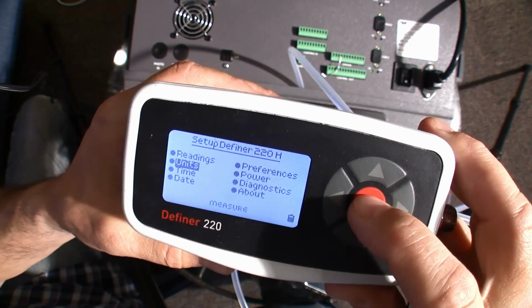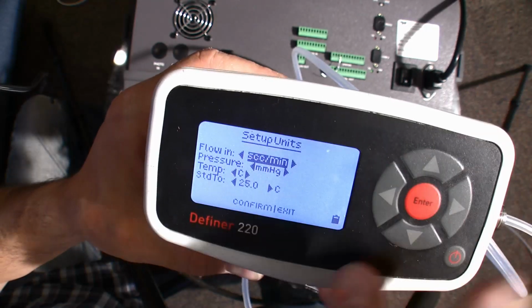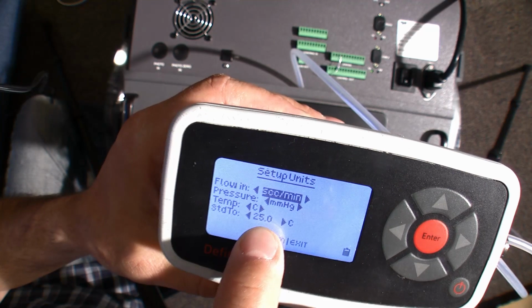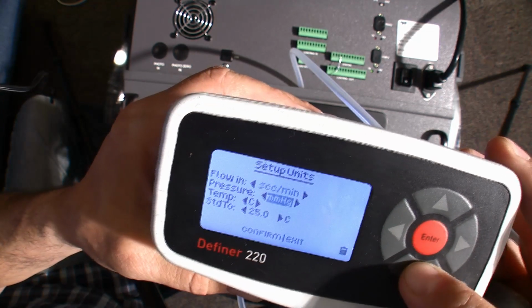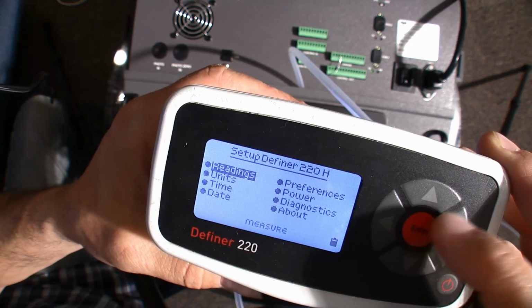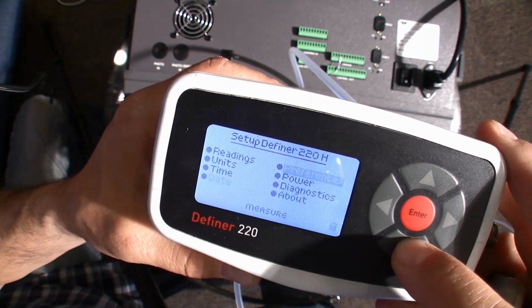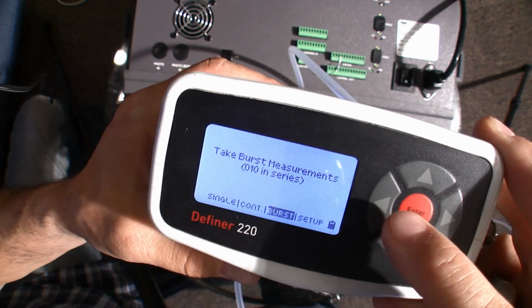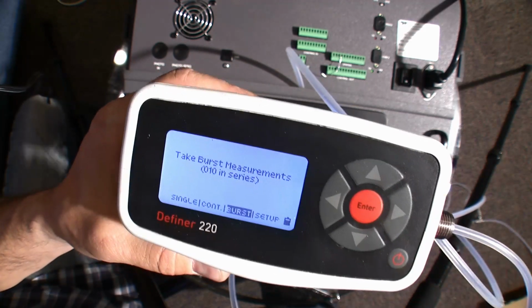And then we want to check our units. When these come back from Mesa Labs, they're almost always going to have this standard temperature set to 21.1. Now in the monitoring world we use 25°C, so make sure that you've saved that, adjusted it, and then confirm if you make a change, and then we'll go back to the main screen. Now I'm going to run this remotely. If you're running it manually, when you get your flow in there and get it started, you just go to measure, you decide if you want single, continuous, or burst mode, and that's that.